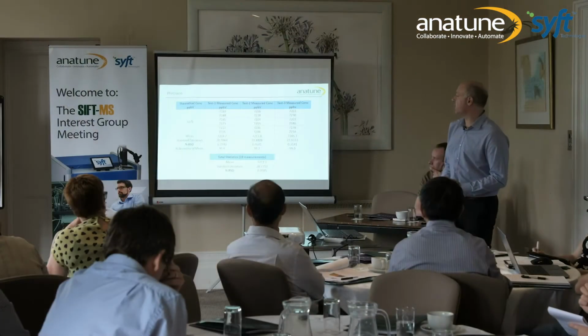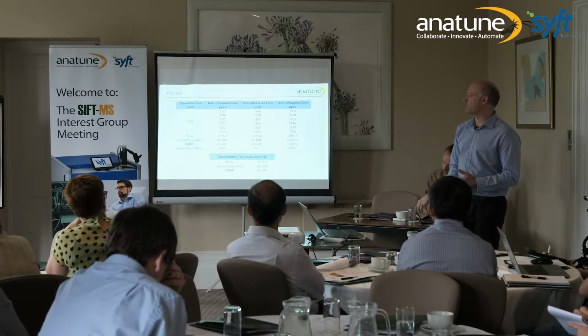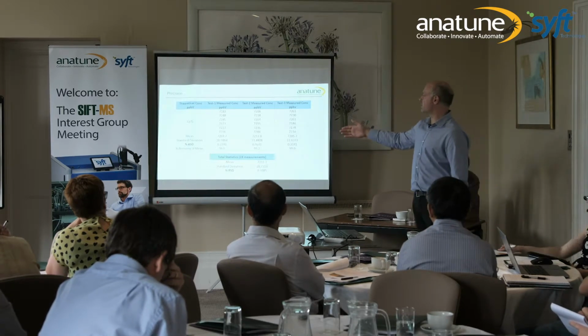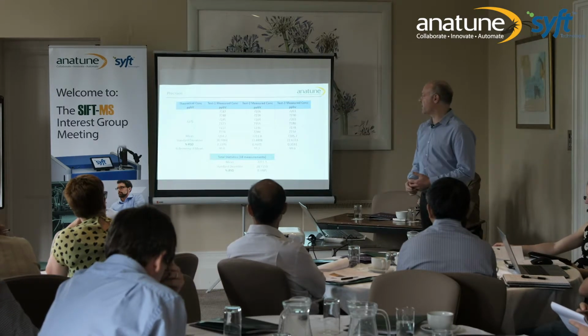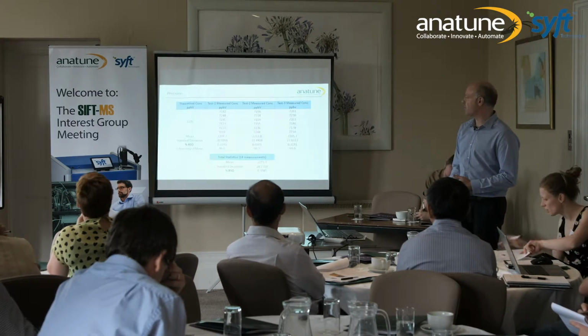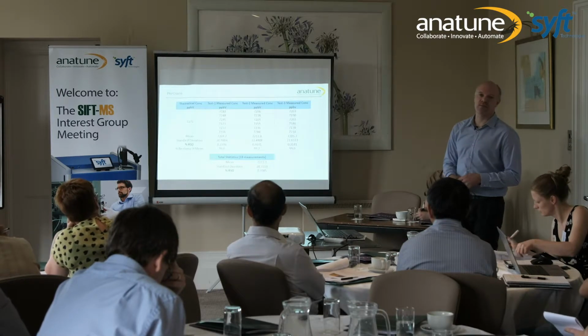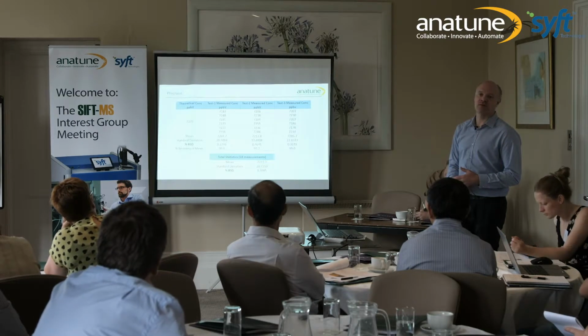And we can see here they generated a theoretical concentration in the bag of 7.27 ppmV, measured it 6 times, 3 lots of replicates, and you can see here that we're getting RSDs for each set of 6 measurements of less than 0.5% RSD. Recoveries 99% plus recoveries for this.